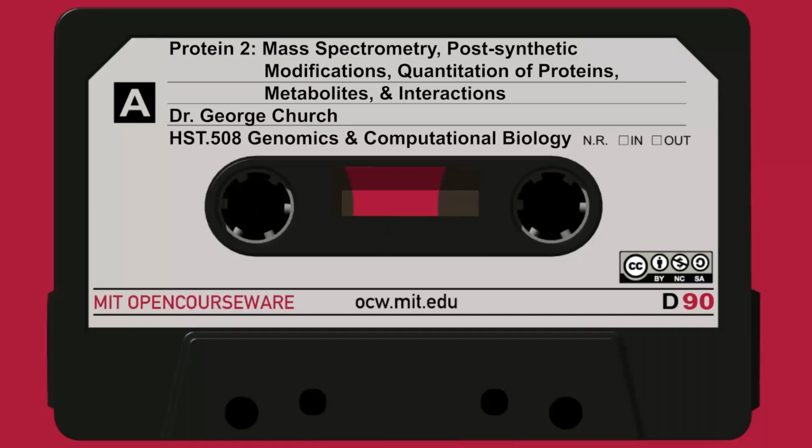Here's another way of measuring the reproducibility. That one was a linear correlation coefficient on a log-log plot. Here is the coefficient of variation. I think we may have mentioned this before. This is just a standard deviation normalized by the mean. In the upper left-hand part of this slide, you can see that the CV, or coefficient of variation, is just the standard deviation divided by the mean. So you can report it in terms of percentage variation.